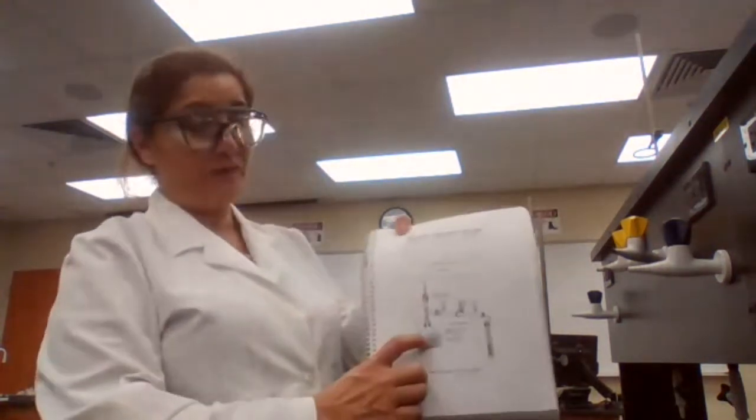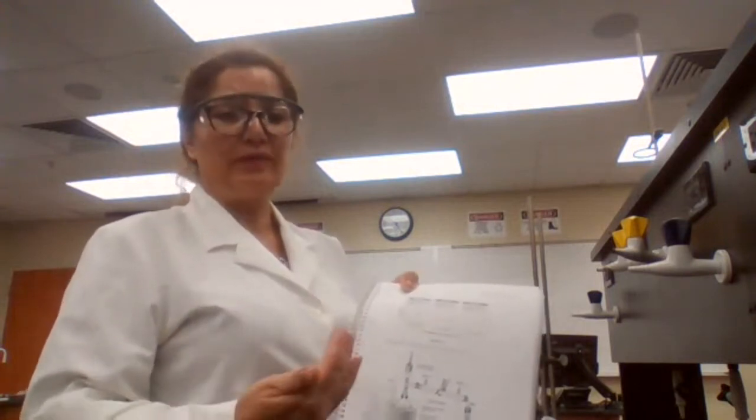80 degrees, yes. 80 degrees is ideal, because what that means is that while the first component, the compound with lower boiling point, is vaporizing, as showing in the diagram, and I will assemble it soon, the other compound stays in the liquid form. So the vapor that is produced initially at the lower temperature is going to be only or mostly the first compound, the compound with the lower boiling point.